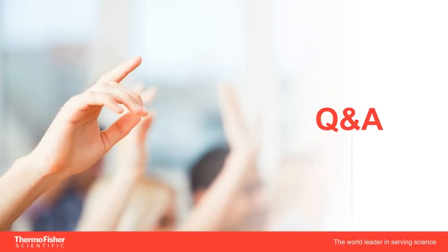Okay, our next question is, what type of gel do you recommend for small MW proteins of 5 kD or less?